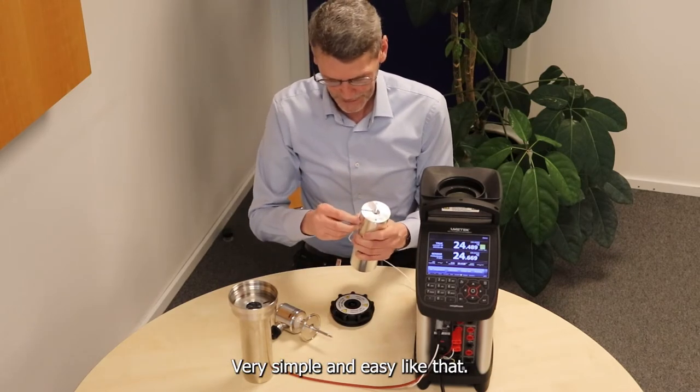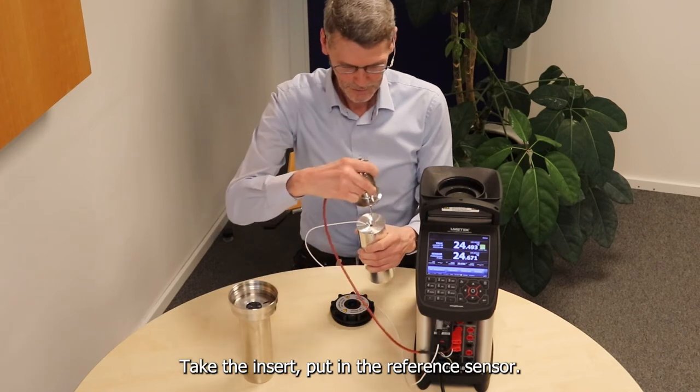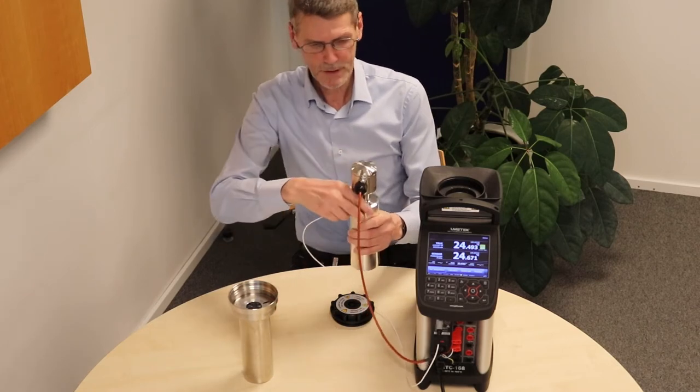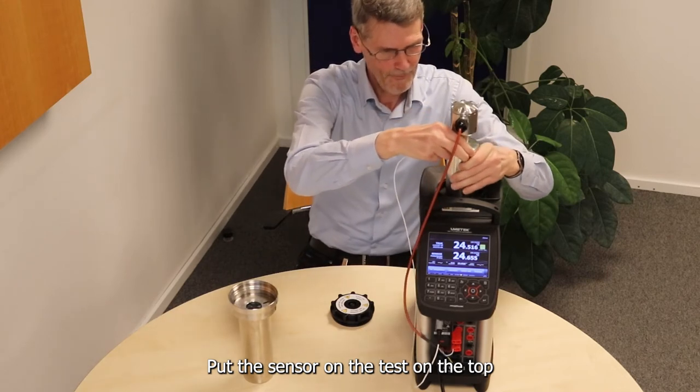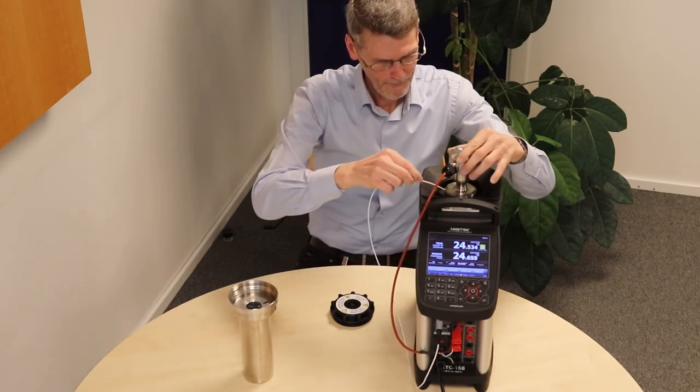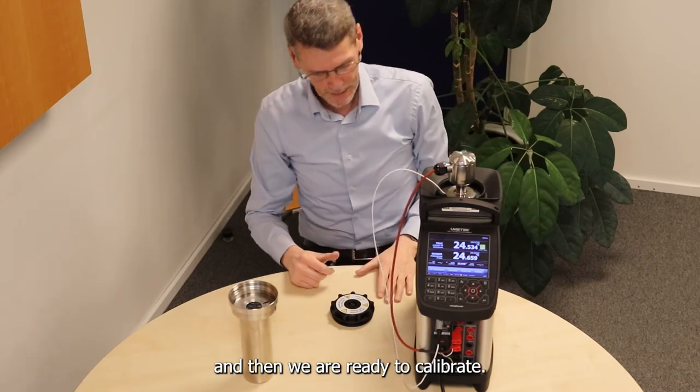Very simple and easy like that: take the insert, put in the reference sensor, put the sensor on test on the top, and then we are ready to calibrate.